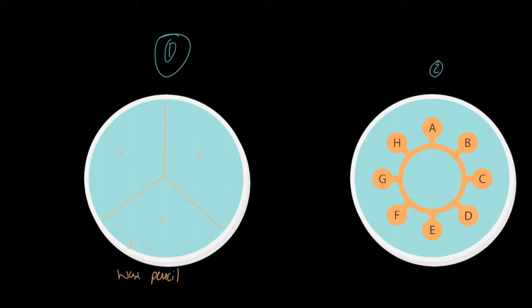So for me it would be JS, and we're going to write on here. I'll put the date on for me right now. Today it's 15th of the 1st, 19.